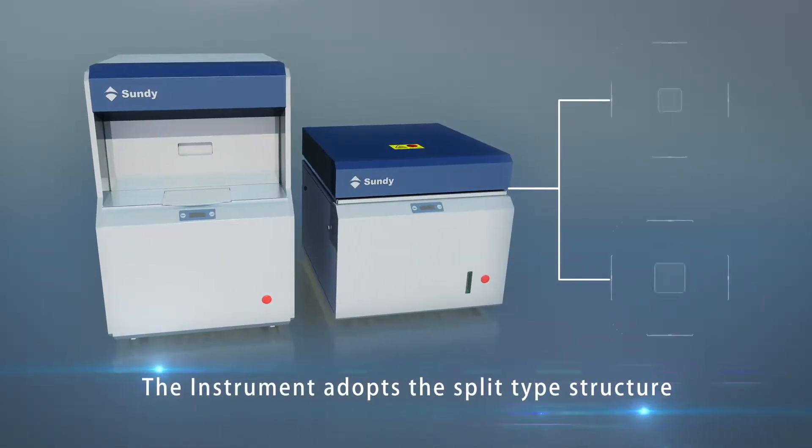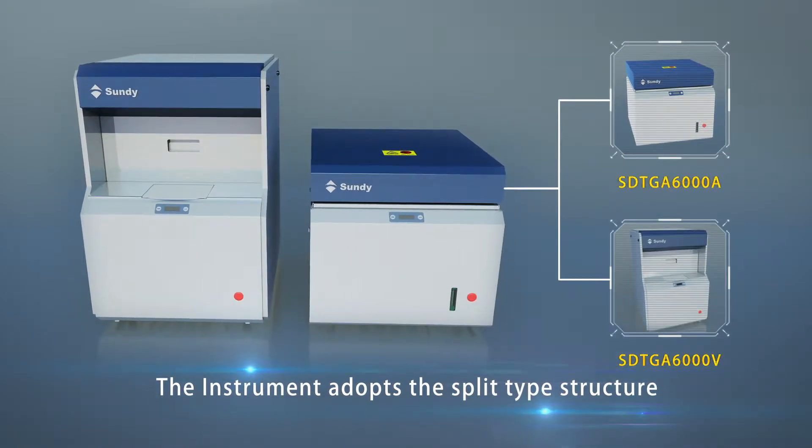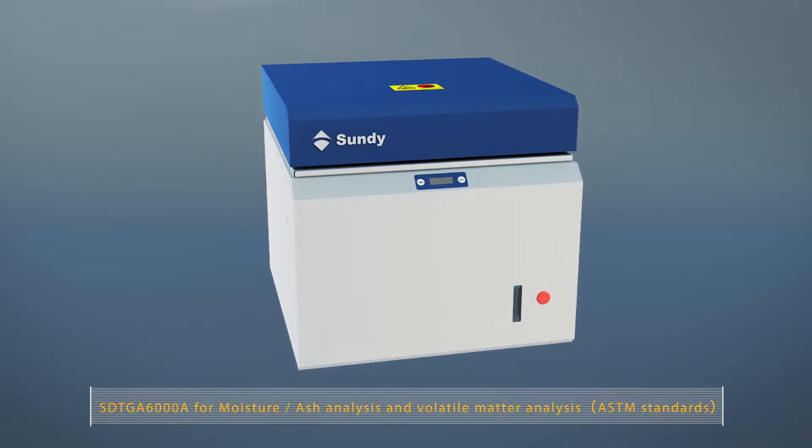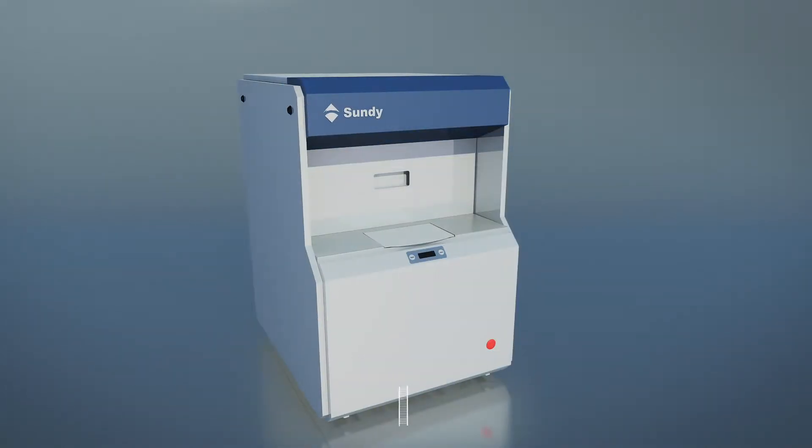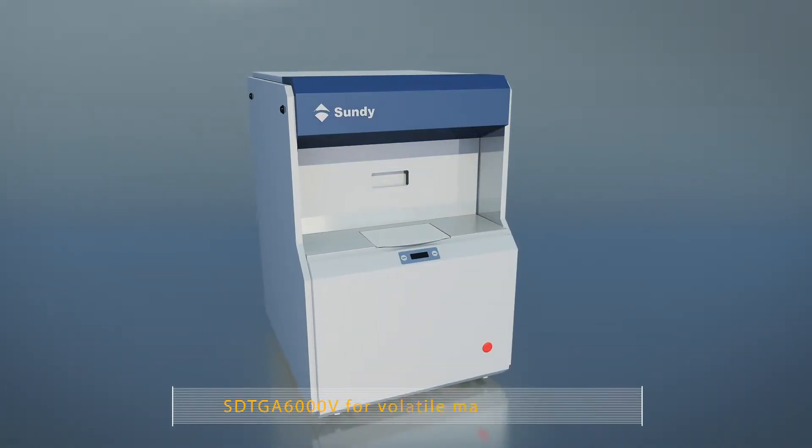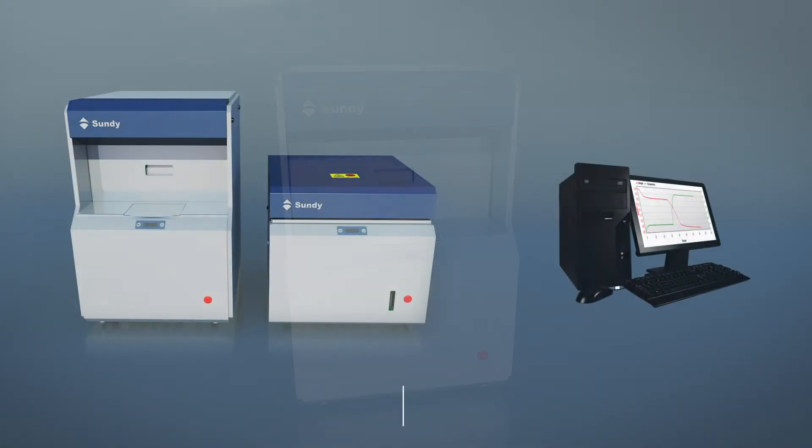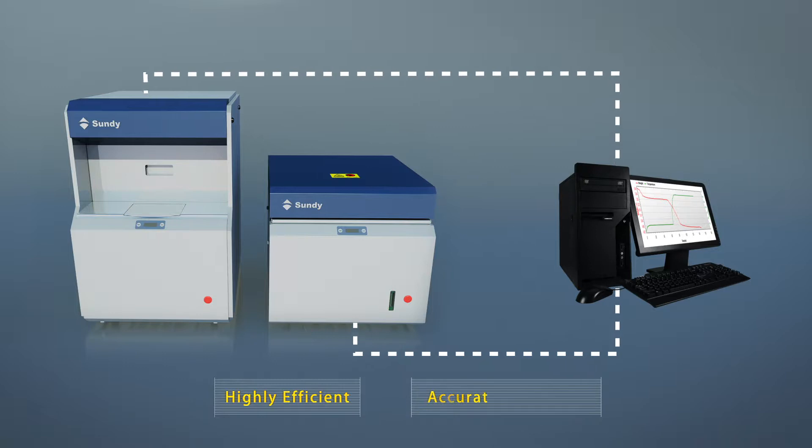The instrument adopts a split-type structure. It consists of two parts: SDTGA 6000A for Moisture and Ash Analysis, and SDTGA 6000V for Volatile Matter Analysis. With independent control, it can do the whole test simultaneously or independently, can be purchased separately, making it highly efficient, accurate, and stable.